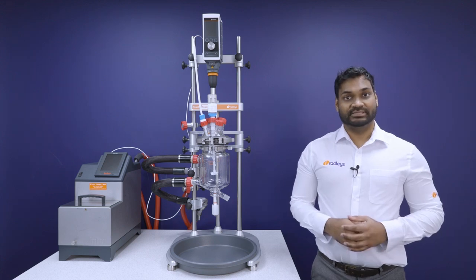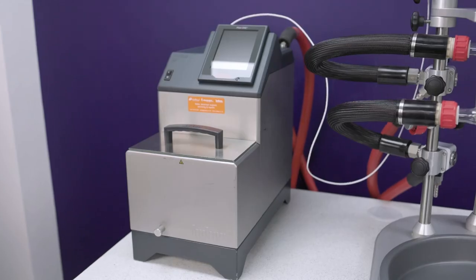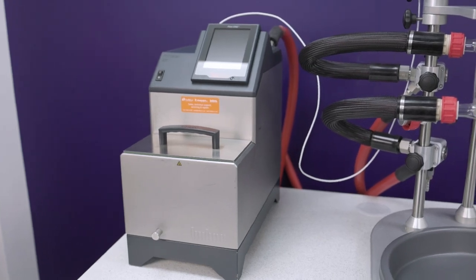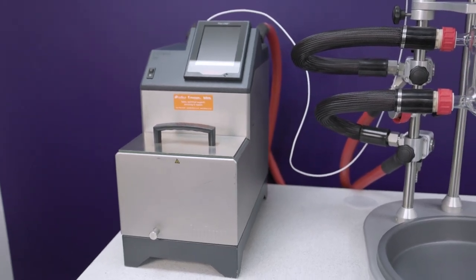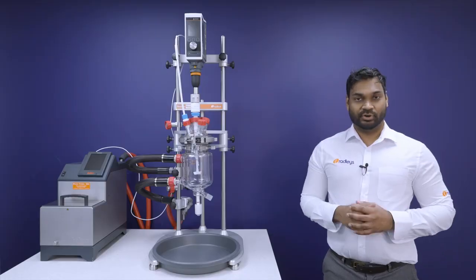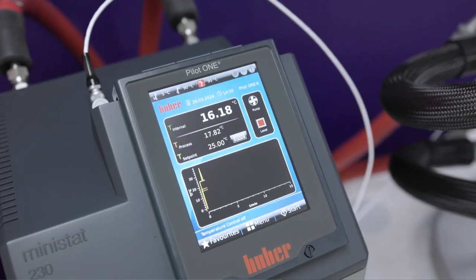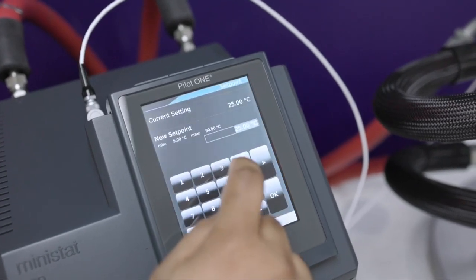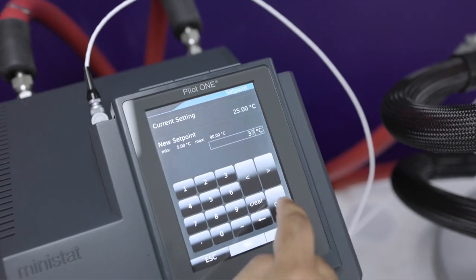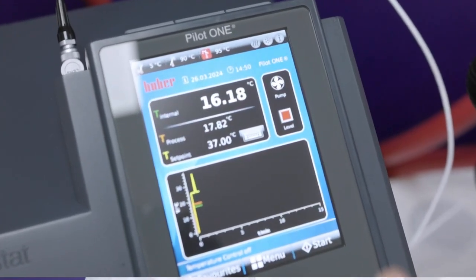Excellent temperature control is achieved by surrounding the actual reaction vessel with a jacket. A circulator, also known as a temperature control unit, heats or cools the thermal fluid and pumps it around the jacket. A temperature probe in your reactor connects to your circulator, which allows you to digitally modulate the temperature of your thermal fluid in order to keep your reaction contents at your set point, whether that's plus 37, minus 60, or plus 160 degrees Celsius.